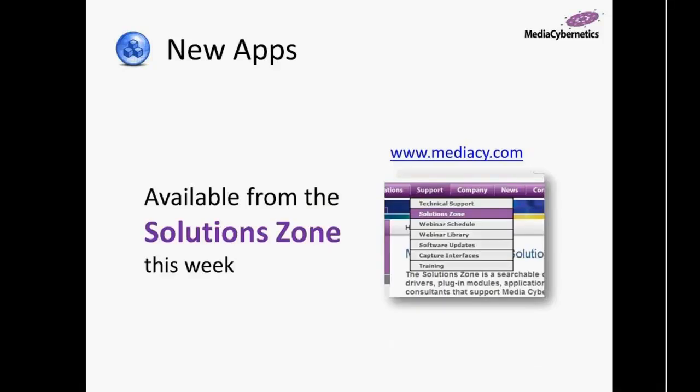So all 6 of these are available from the Solution Zone. They'll be posted this week. After our announcement today, we're going to be hard at work putting all this incredible information up on our website and available to you. Lots of announcements coming out as we go through the week, and we're really looking forward to getting in your hands and you being excited about this as we are.